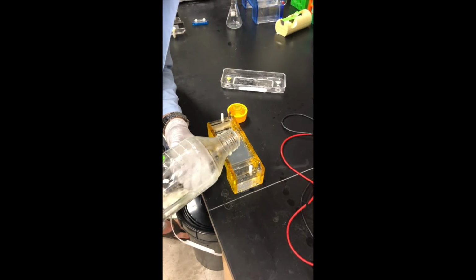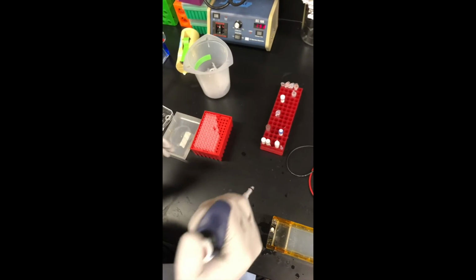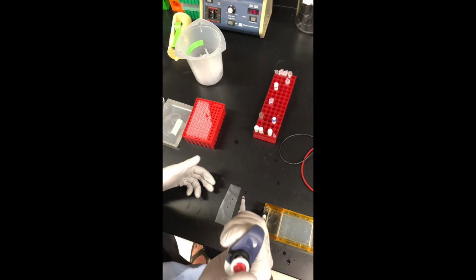We're only a little bit here, but sometimes there's a little more spilled. All right. So next step is we're going to grab parafilm and then begin loading the gel. Okay, so now we've prepared the parafilm and then loaded it with 1 microliter of the loading dye.